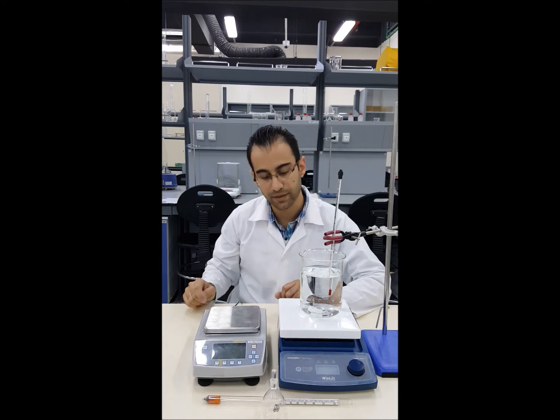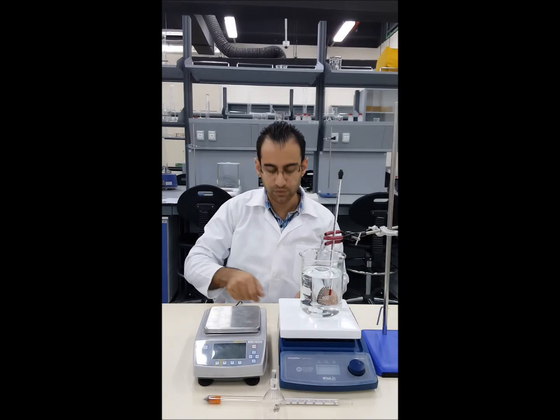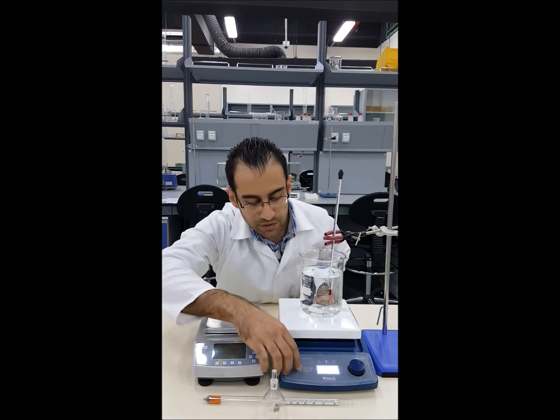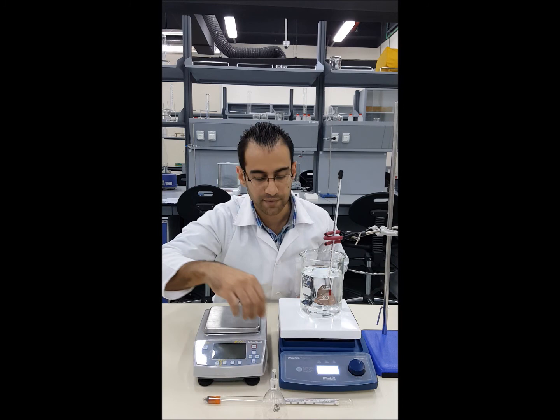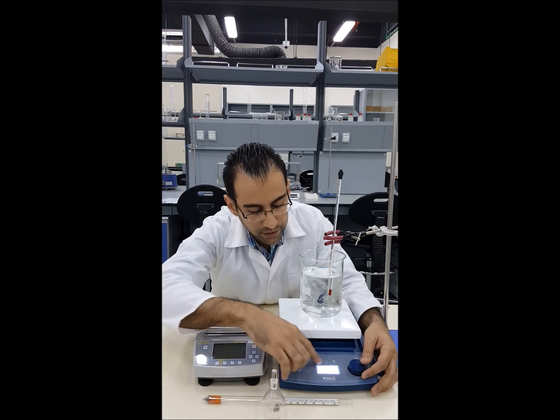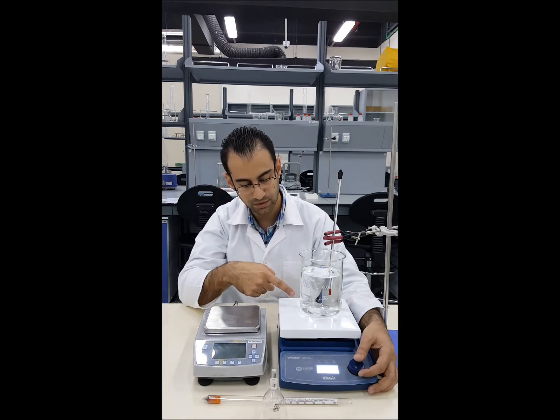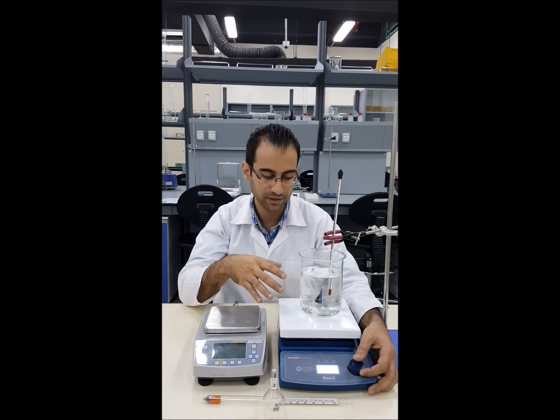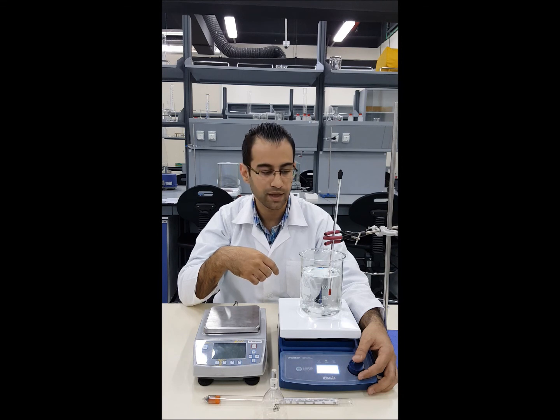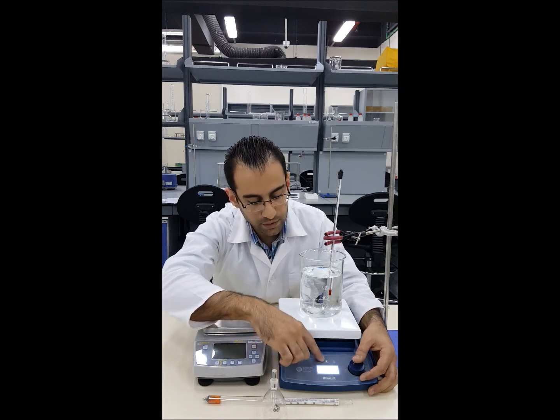Then we have temperature mode, which sets the temperature of the hot plate, and the last mode is the timer — we are not using the timer in this experiment. To set the RPM of the stirrer, change to stirring mode, press the knob, and start turning. There is no specific RPM required, so around 150 to 200 RPM is fine, which keeps the water circulating so we can assume all the water is at the target temperature.